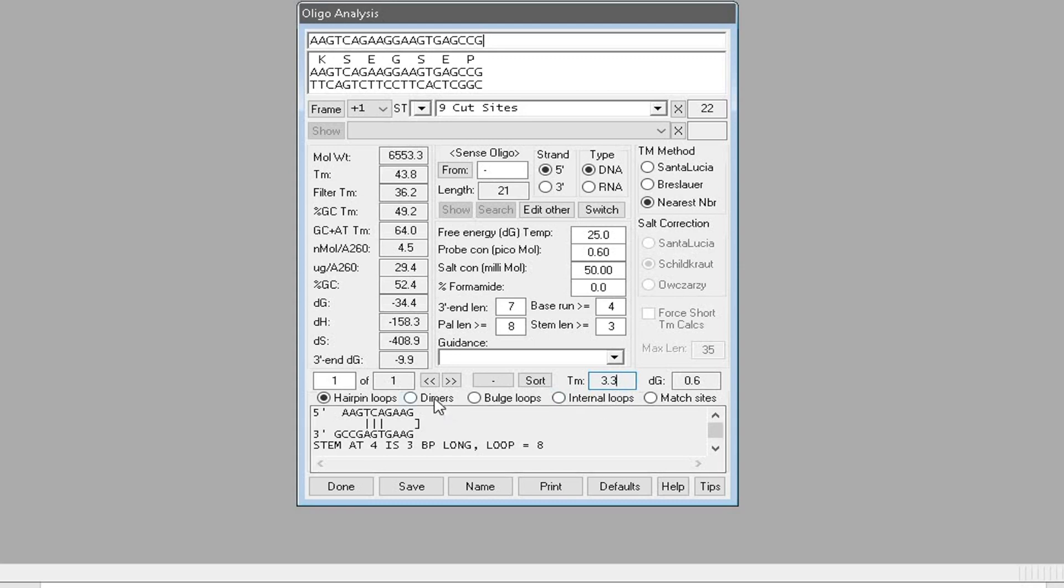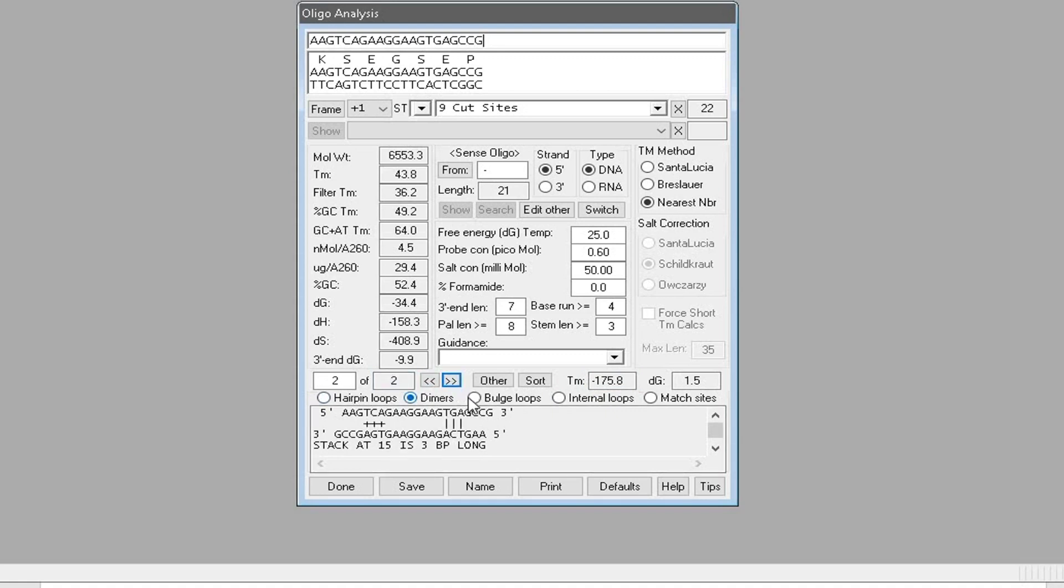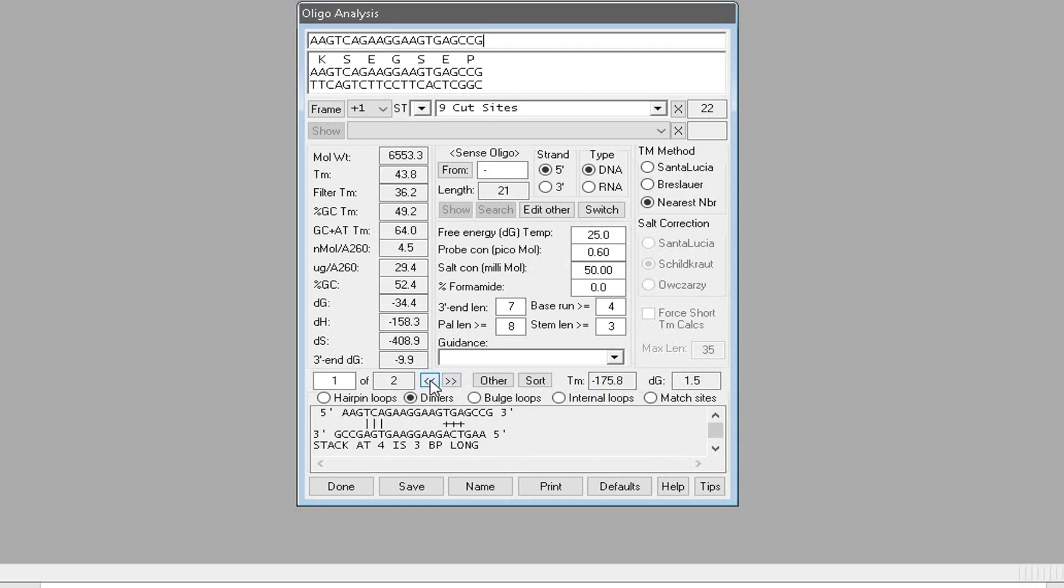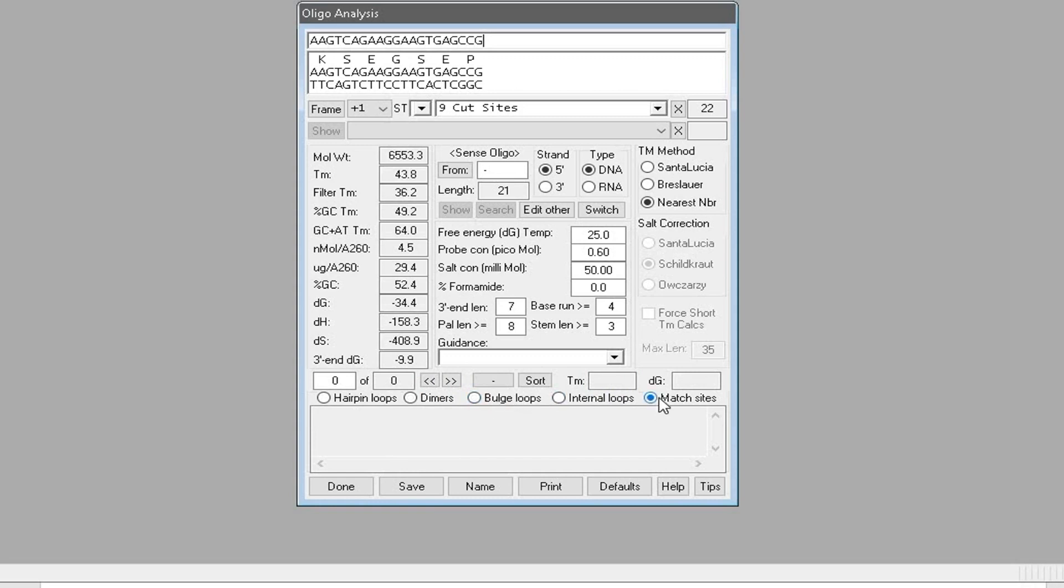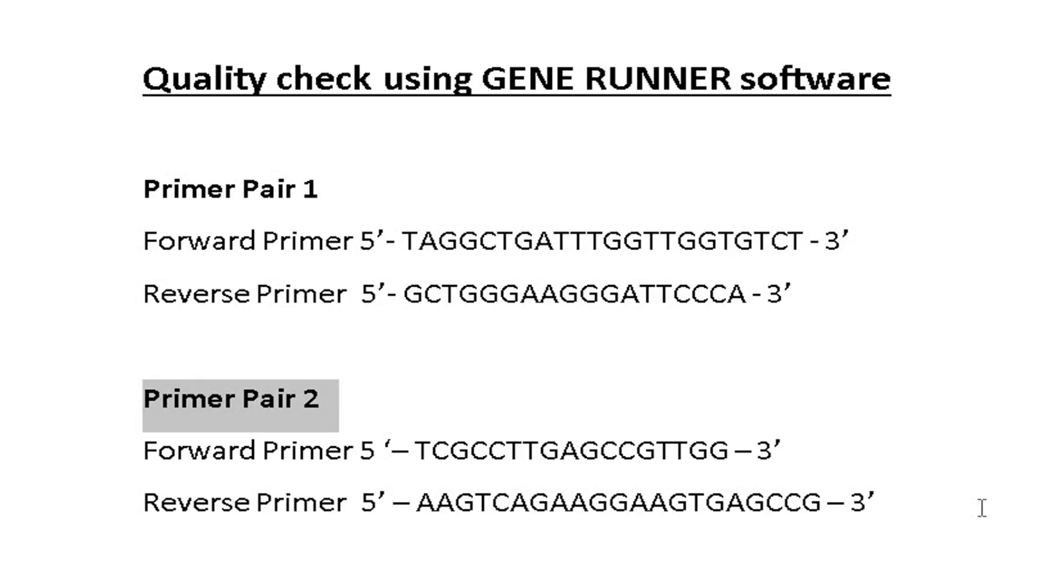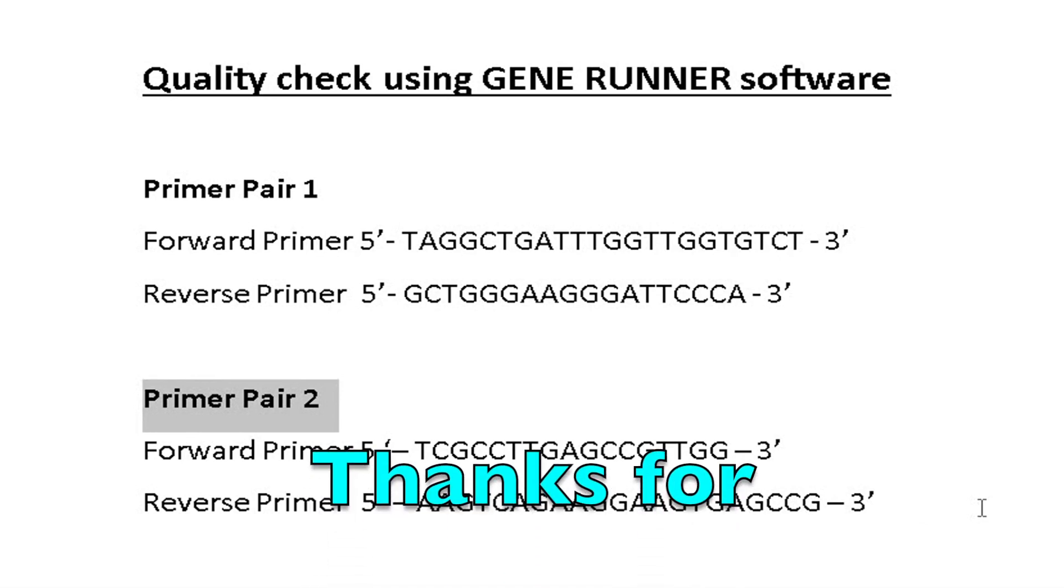The two dimers detected by this software can also be ignored since the thermal cycle will not achieve minus 175.8 degrees Celsius. This software did not detect any bulge loops, internal loops, or match sites. Considering all these parameters and properties, primer pair two can be selected for further use.